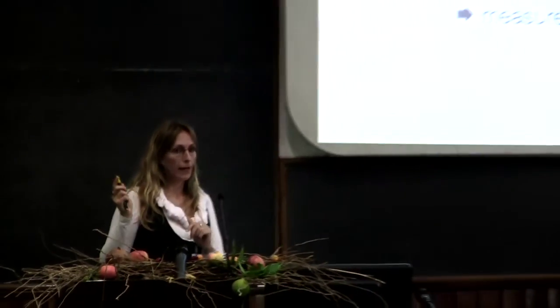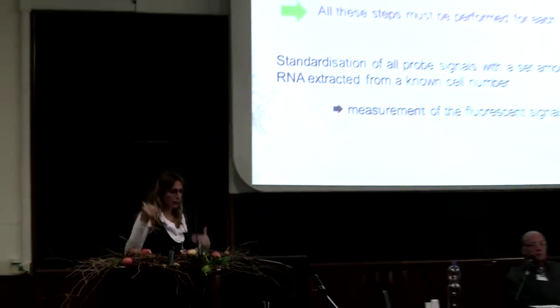And you will do that for different points. We went from 5,000 cells to 500,000 cells. And then we've got calibration curves.